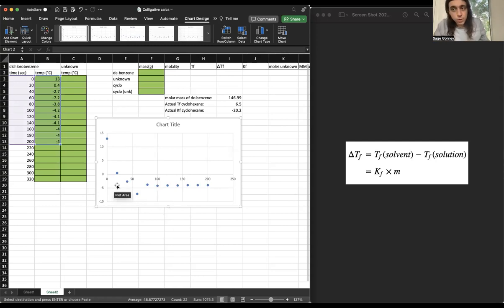And that's for reasons we won't go into. But how we are going to fix that is we are going to use the intersection between our initial decrease in temperature here between these first 2 points and that line's intersection with this linear portion of our graph over here. So it's going to meet somewhere over here, and you'll see what that means as I do this.